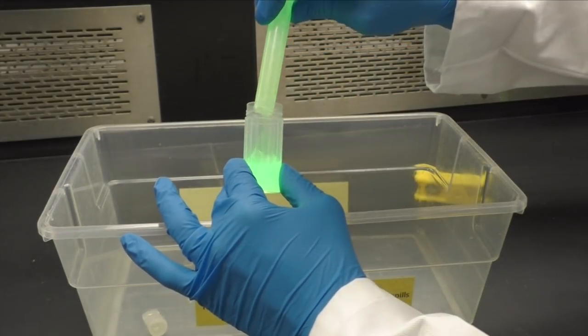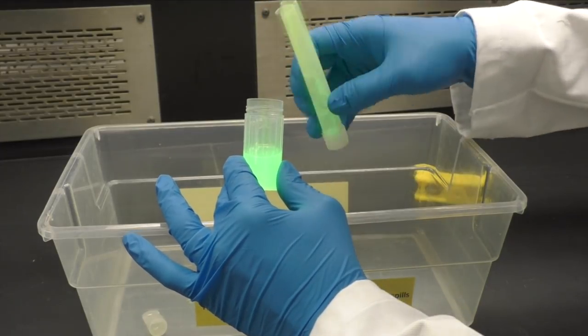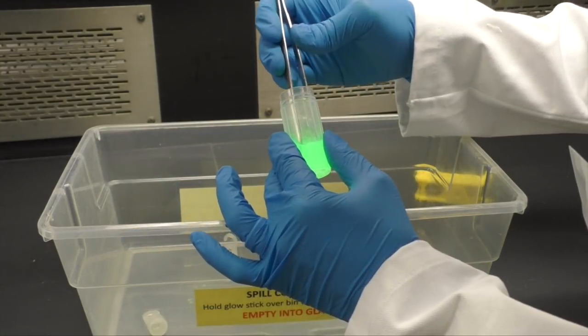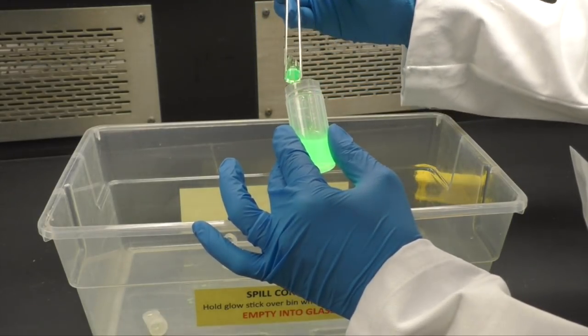Next, pour the glow stick solution into a 20 milliliter plastic vial while still holding it over the spill bin. If there are a lot of small glass pieces in your vial, use your forceps to transfer the pieces into the spill bin.